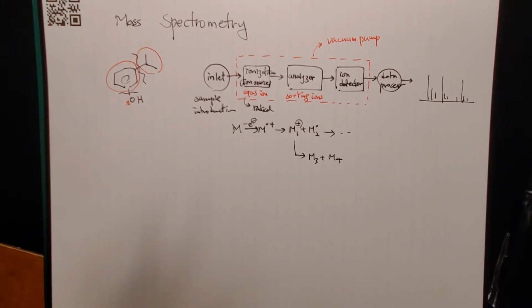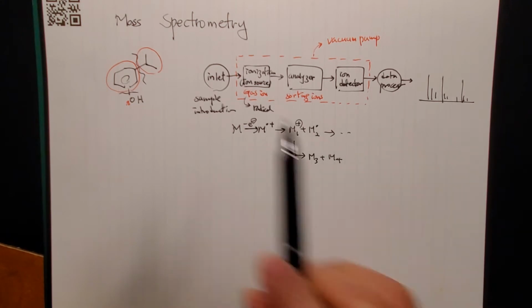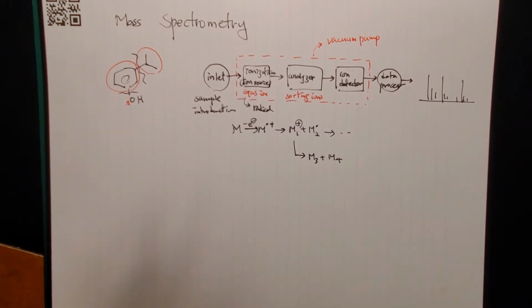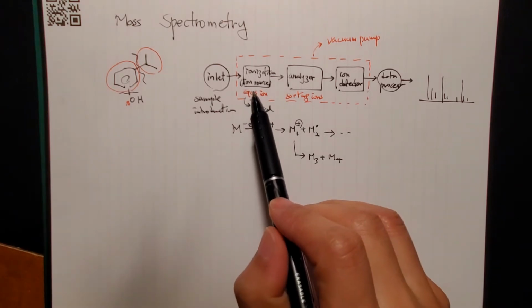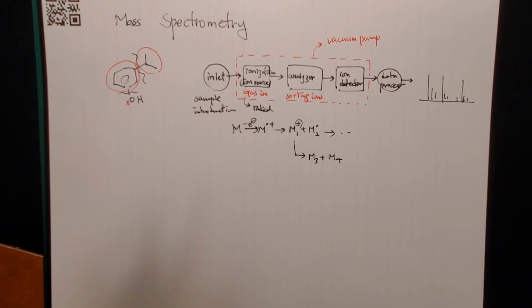Unlike IR instruments, mass spectrometers come in very different ways. The techniques for each step could vary so much. So I'm going to briefly mention what methods are available for each step, so you can choose wisely for your own sample.